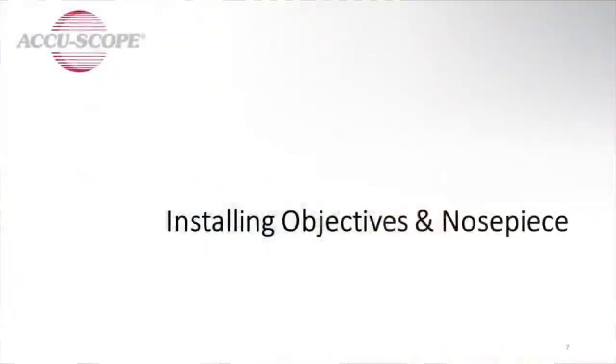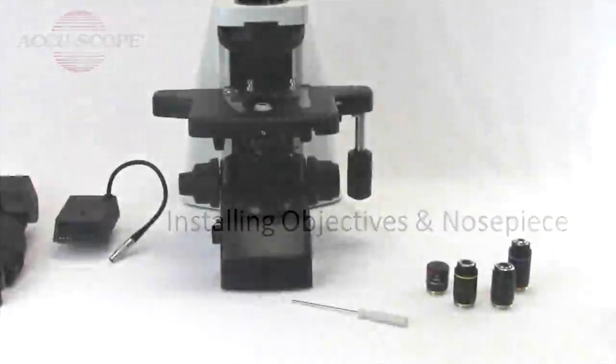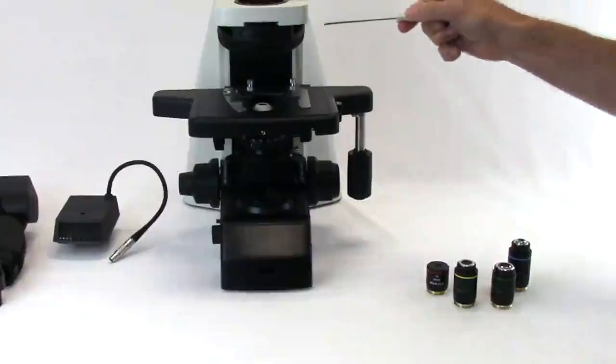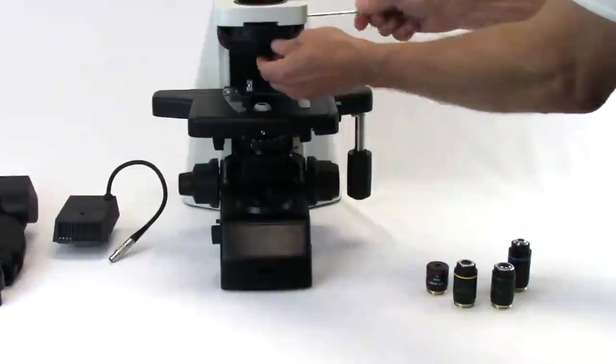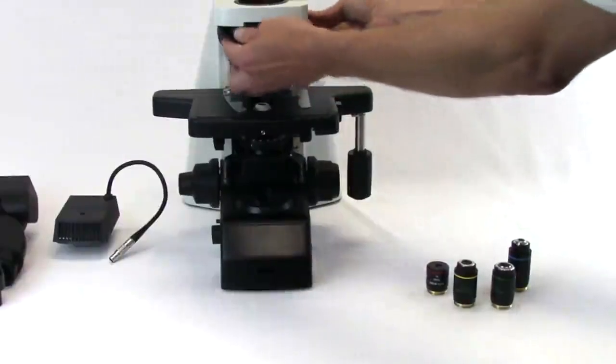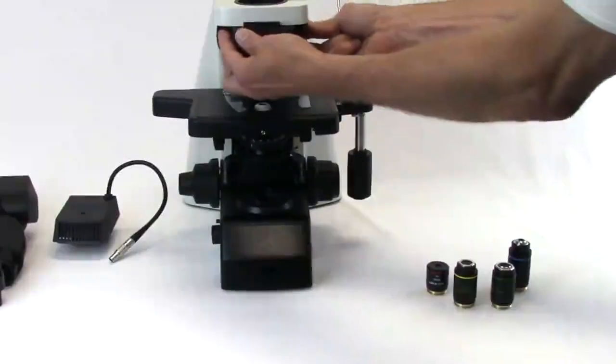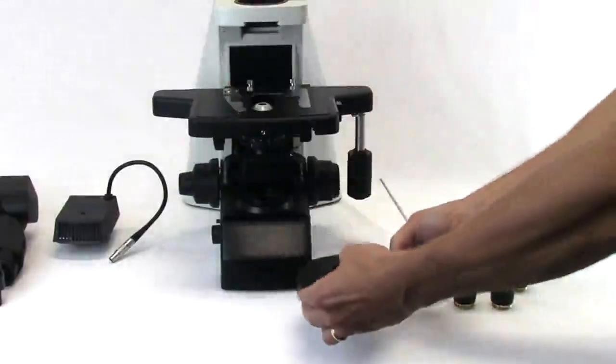Installing the objectives and nose piece. Using the hex wrench, loosen the lock screw and slide the nose piece toward the front of the microscope to remove it. Turn the nose piece over so that the dovetail is down.